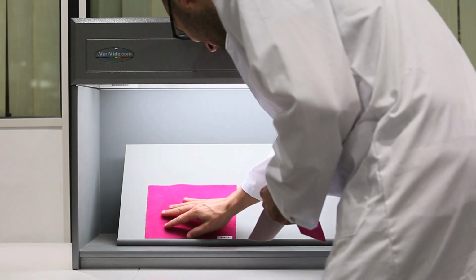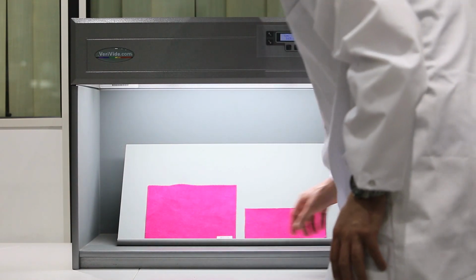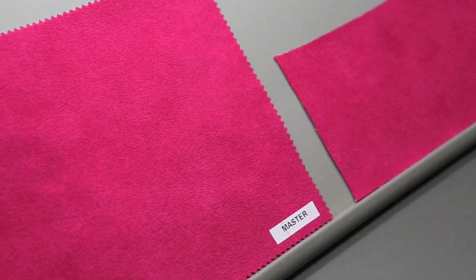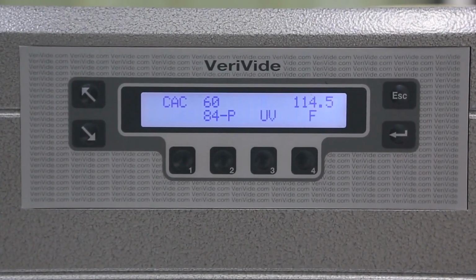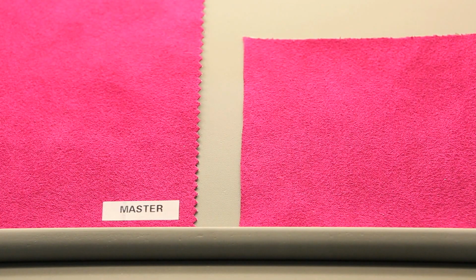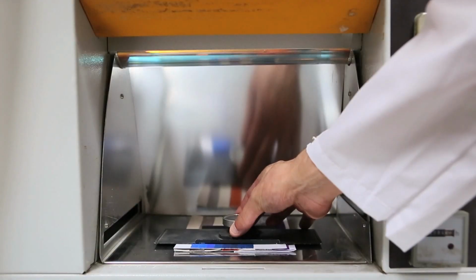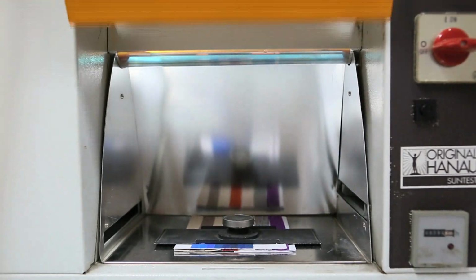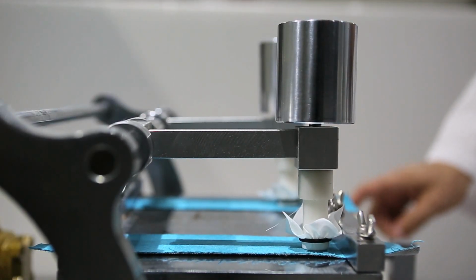Color and shade also take part in the evaluation process, through which every fabric must go before being launched in the market. Aurim uses several instruments to monitor them. A light box, which allows for the control of the differences between production samples and the master reference. A sun test system used to verify color fastness to light, and a croc meter, which measures color fastness to rubbing, both wet and dry.